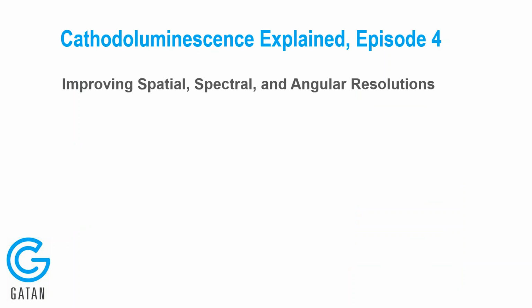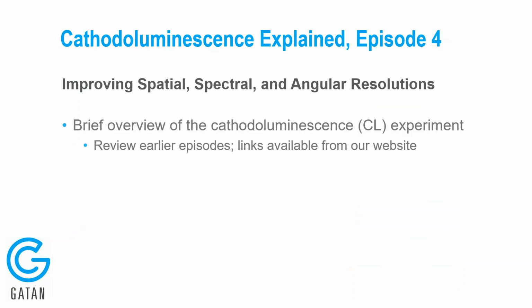Thank you. Hello, everyone. Welcome to episode 4 of Cathodoluminescence Explained: Improving spatial, spectral, and angular resolutions of luminescence data. So this is episode number 4, so I'm going to give a very brief overview of the CL experiment, more particularly the hardware involved in it. And if you want to know any more information about cathodoluminescence, please go back and review the earlier episodes that we've done. There's lots of information contained there, and there are links available from our website in order for you to be able to view those previous episodes.